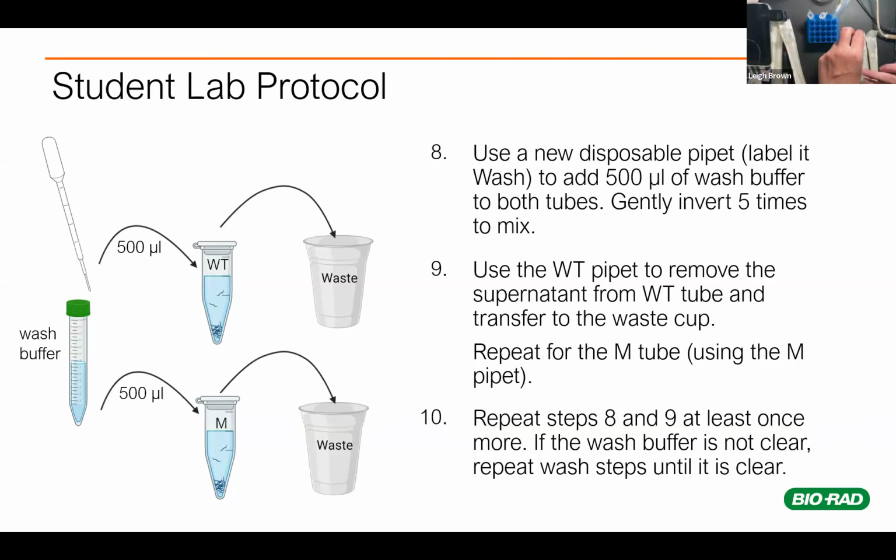Yeah, wash buffer is something you don't necessarily need to be stingy with when you run this kit. And so that's always something to also keep in the back of your mind. You're not running PCR or something like that where you're like, oh, I don't want to waste any of that reagent. Go ahead and do it to make sure that the worms are nice and clean.